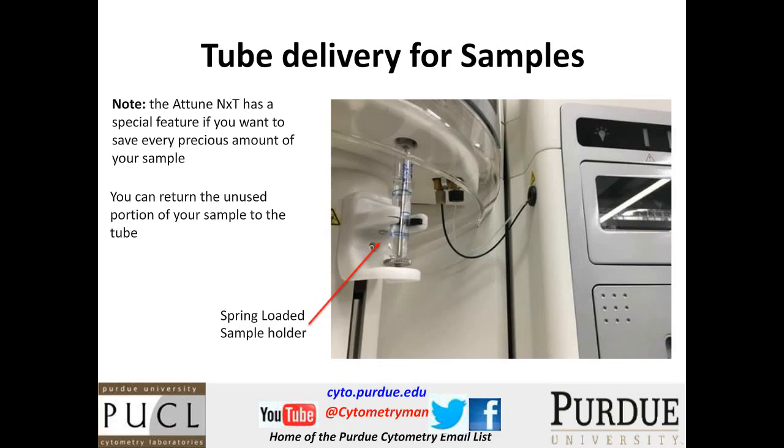And the advantage is that hidden underneath here is a valve, and that valve has a link between this and the system. So by simply pressing a switch, you can switch from here to here, and you can run the system. That's actually a really, really nice feature. It's a well-engineered system. A lot of thought has gone into the fact that often you'll use a tube to calibrate a system and run a plate on your system.